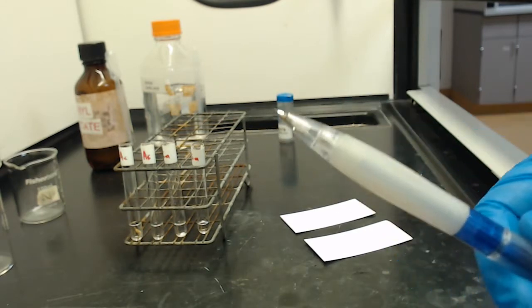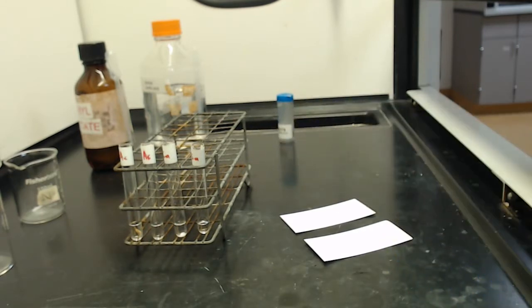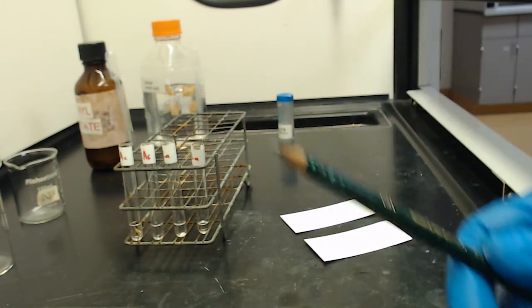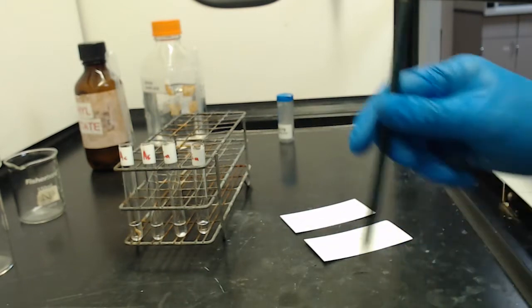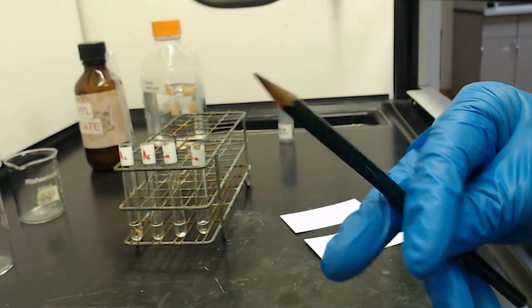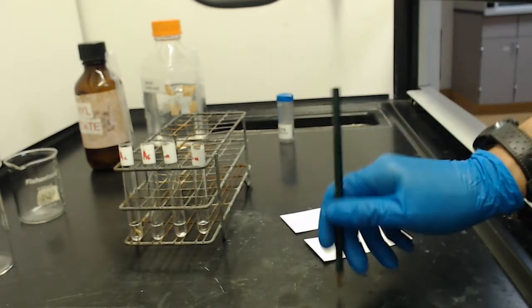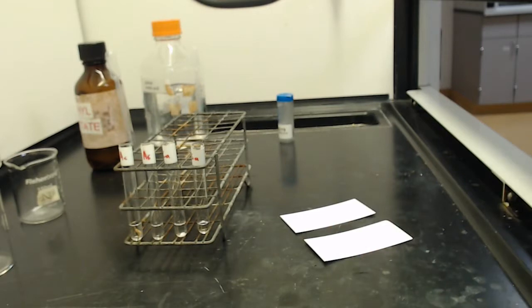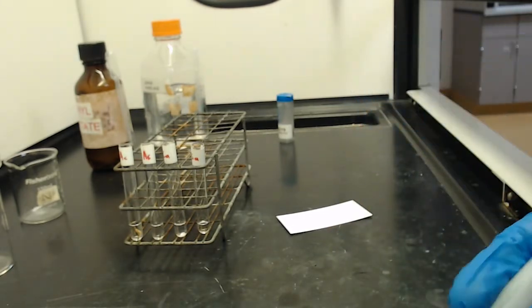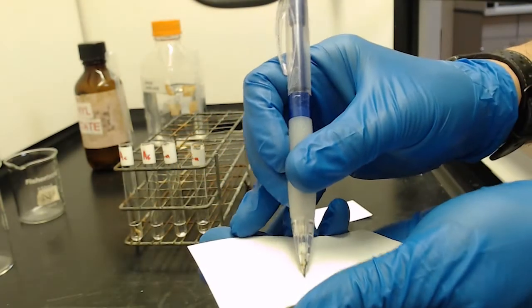You also don't want to use a mechanical pencil, because these tend to be a lot sharper on the point than your standard ones. And if you sharpen a pencil too much, I actually recommend tapping it on the counter a little bit to dull the tip. You want a dull tip on this, not too sharp of a tip. So I'm going to tap it a little bit to make sure it's not too sharp. I do want to give you an example of why you don't want to use a mechanical pencil, because I'm just going to draw a line on here, and we'll see what happens.